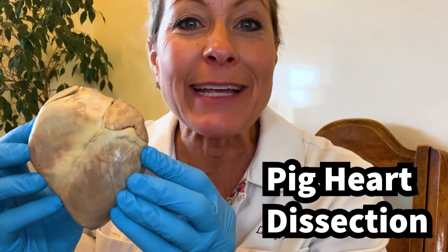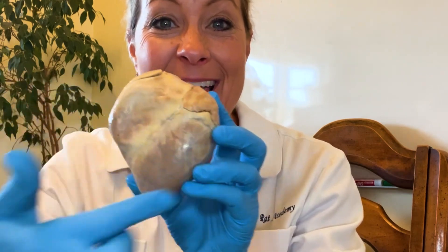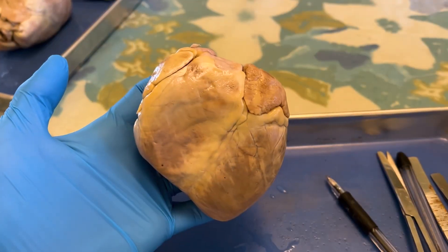Hey you science lovers, it's Becky with Lab Rat Academy and we are going to be doing a pig heart dissection today, and this is what it looks like before we open it up.